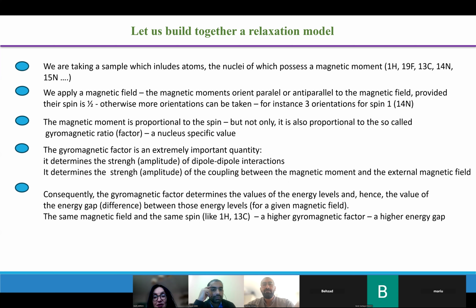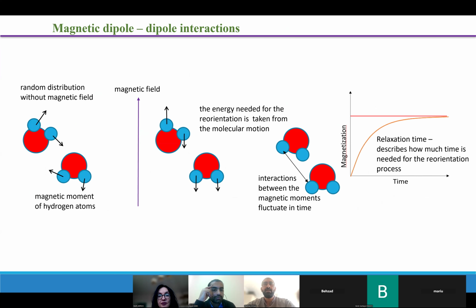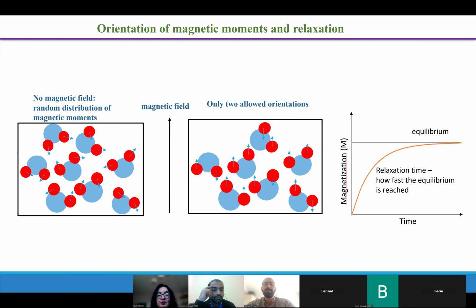But can we take the cumulative effect of the entire glass? Like if we say that there are 210 molecules, out of which 100 are parallel and 110 are anti-parallel. This is exactly what we are doing.